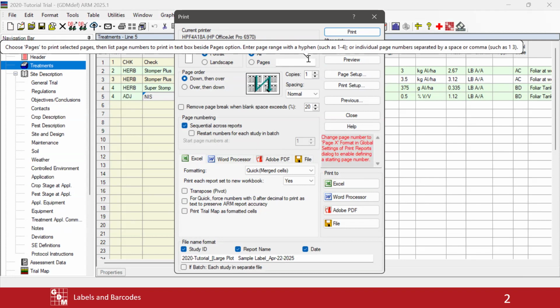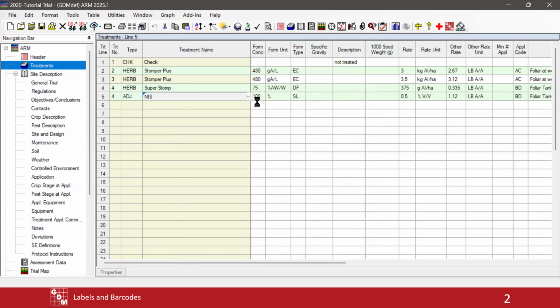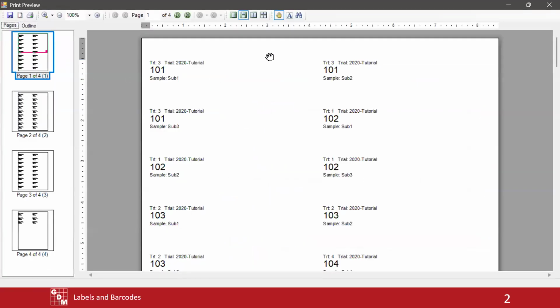You can just print it to a regular sheet of paper and then set that sheet of paper on top of your actual physical labels to see, does it line up? Or did I mess something up? Do I need to tweak my margins? Things like that. Since it is a little hard with this preview, you can't visualize the boundaries of the real labels quite. Printing this out to a regular sheet of paper and setting it on top helps you say, yeah, I think it's going to be right, or oh no, it might be off a little bit. I wonder if my margins aren't quite right.